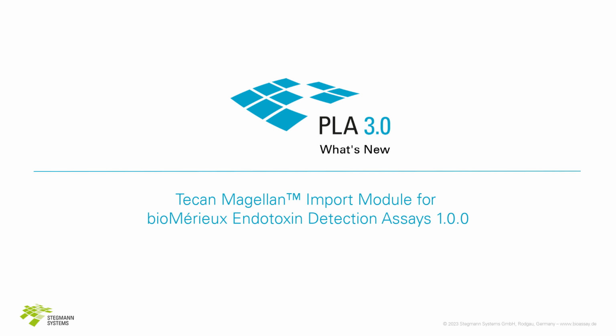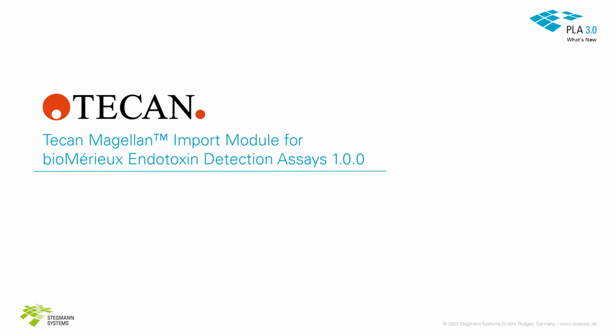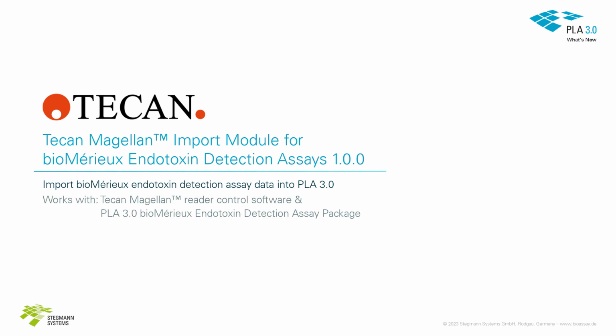In this video, we introduce our new import module, the Tecan Magellan Import Module for bioMérieux Endotoxin Detection Assays. With this import module, you can transfer bioMérieux Endotoxin Detection Assay data into PLA 3.0. It works together with the Tecan Magellan Reader Control software and the PLA 3.0 bioMérieux Endotoxin Detection Assay package to obtain and analyze assay data. The data import also integrates smoothly into automation procedures and is fully compliant to the regulations of the pharmaceutical industry.